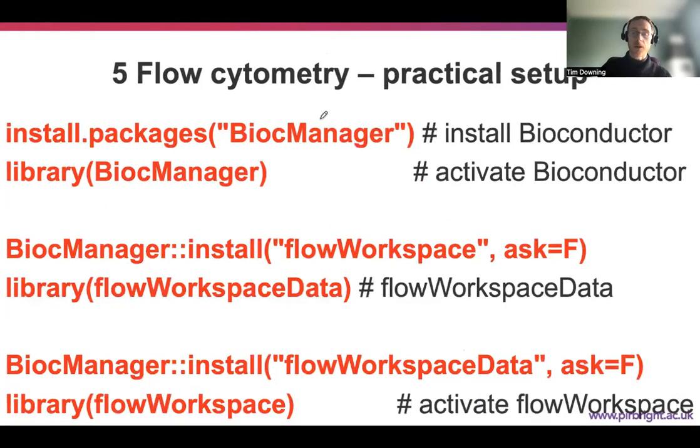We're going to use these packages that come from BioC Manager, which installs Bioconductor. So we're going to install these packages and switch over to RStudio now.